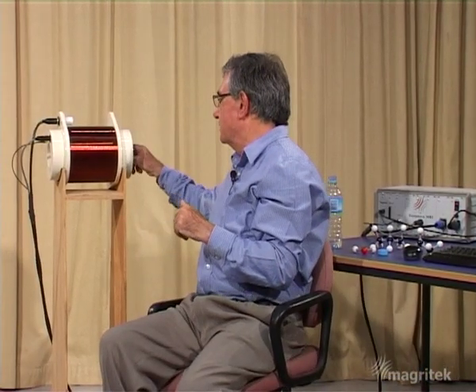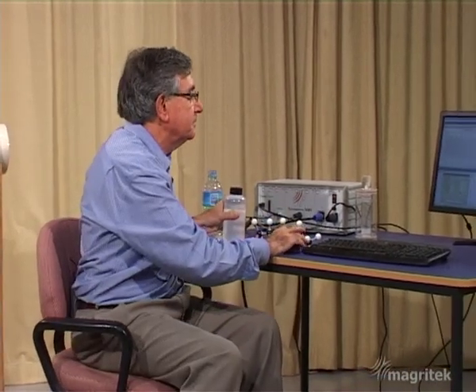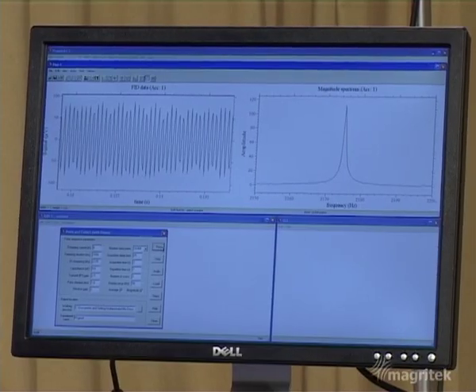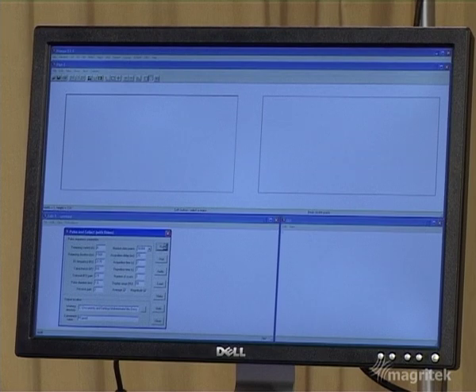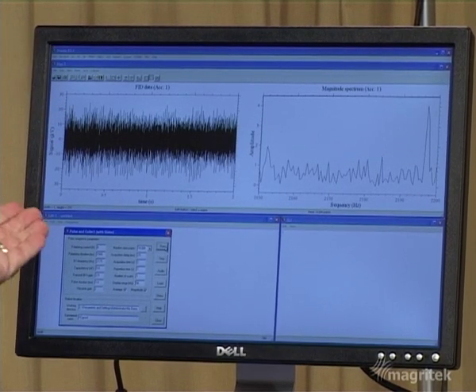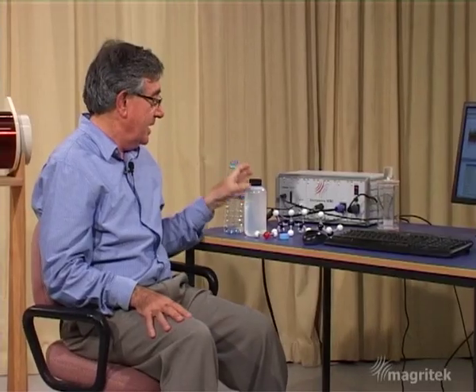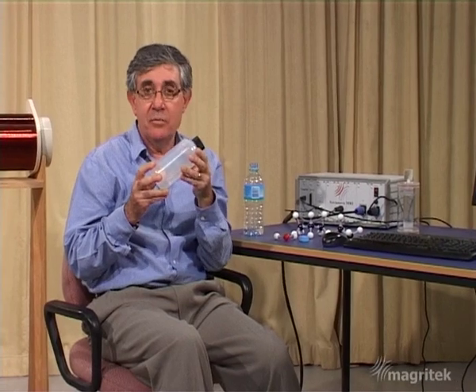Really, we should check this is real. I'm going to remove the water sample and we'll run this experiment again and see what happens. Prepolarizing pulse. No free induction decay, just noise this time. We really are getting a signal from this bottle of water.